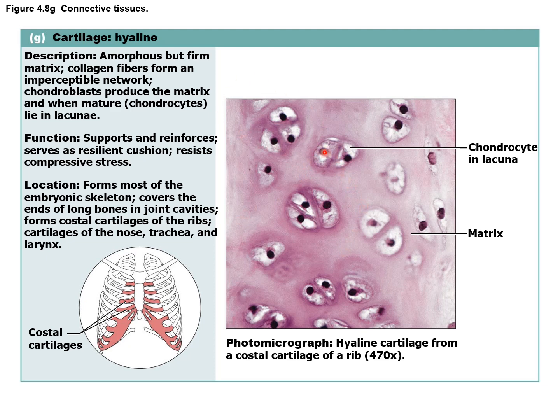Here you can see the chondrocytes trapped in their lacuna, and the extracellular matrix is made up mostly of water, but some proteins to thicken the material and make it more gel-like. Where do we find hyaline cartilage? Here's the list, and these are all going to be important.